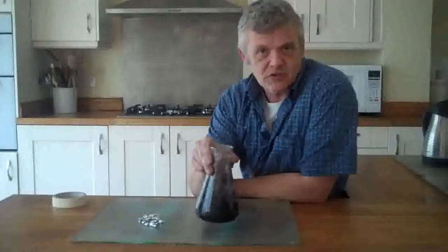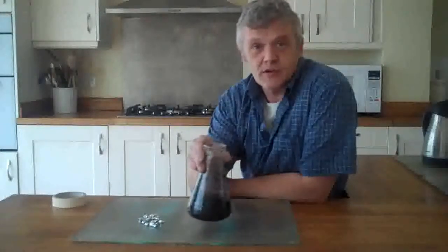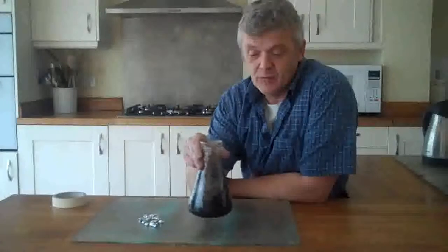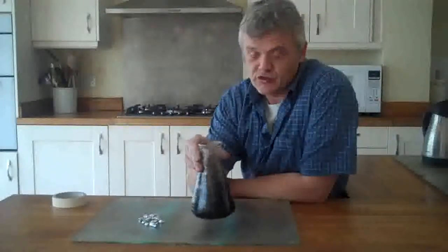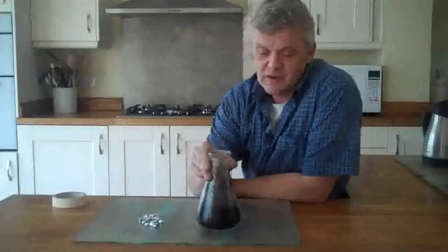The 10% won't really damage you as long as you get to the water supply very quickly and wash everything off. The 35% will do some damage if you're not careful with it. So what I tend to do is add the aluminium in small amounts.